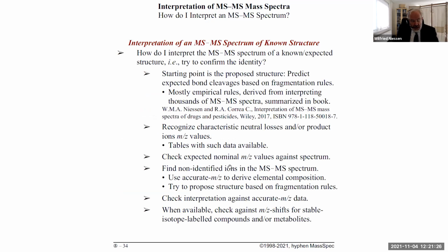In the final session, we are going to do a couple of things. I would like to start with this: at a certain stage, I decided to write down the steps I take if I interpret an MSMS spectrum of a known or an expected structure. My starting point is the structure or proposed structure. From this, I predict expected bond cleavages based on the fragmentation rules I've developed.